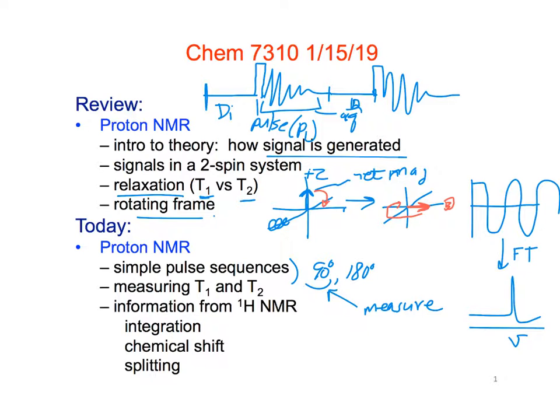And then we're going to look at two methods to measure the T1 and T2 values.